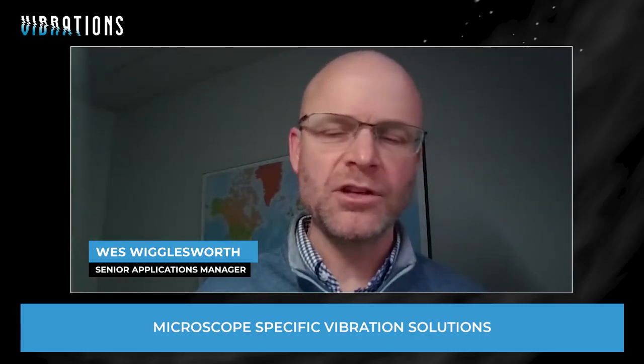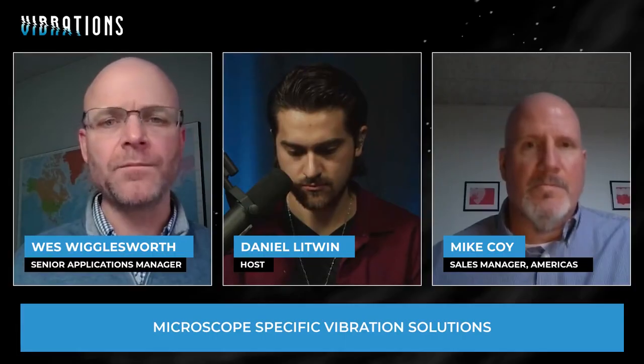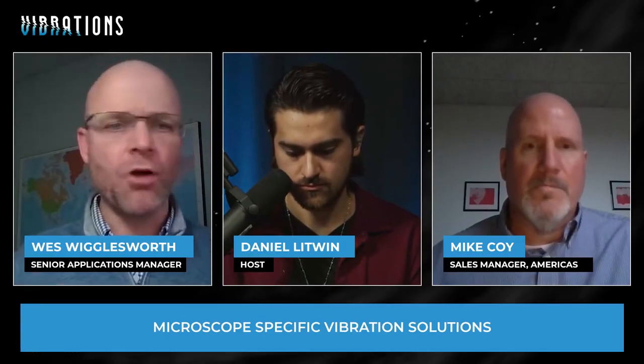So they called us. We went in to do the vibration assessment, looked at the environment. He explained what was going on. And it's basically a very low frequency coming through the ground. Again, the internal isolators in the microscope don't take care of that, and the wrong kind of platform underneath the microscope won't address it either, because it needs to be a very stiff, active hard mount type isolator that's going to measure that vibration and cancel that low frequency vibration.